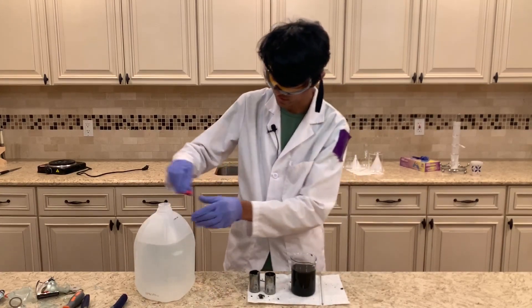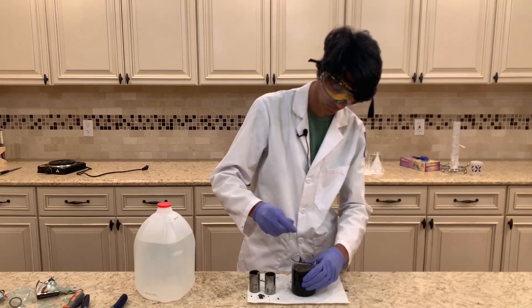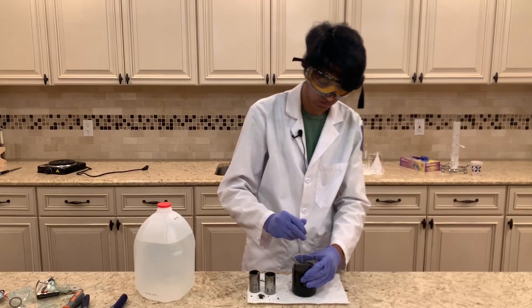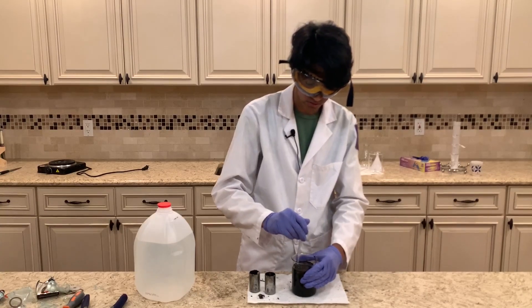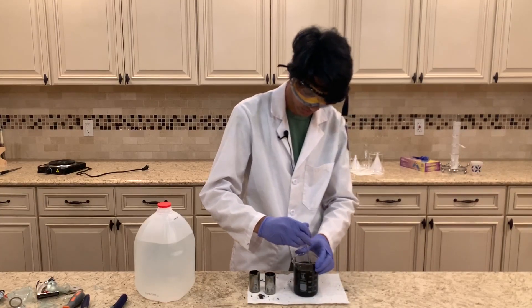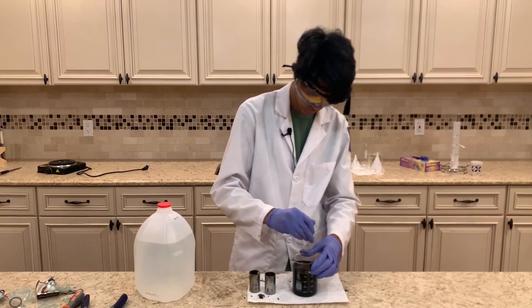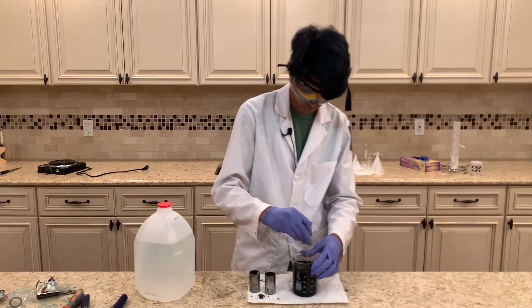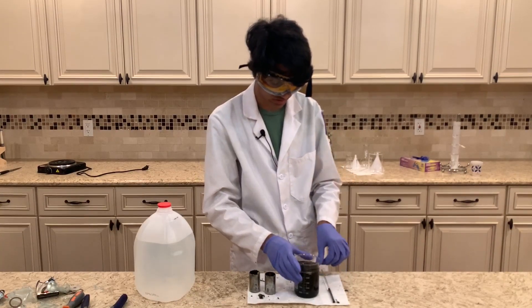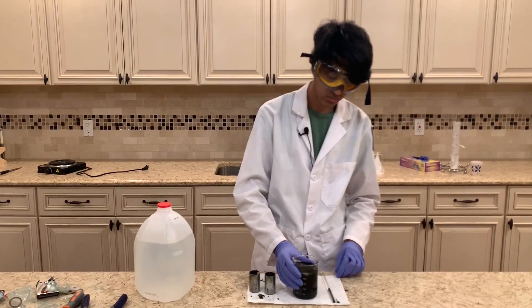I added the distilled water and now I'm mixing it using a glass stir rod. Basically what this is going to do is get rid of anything that's water soluble in the manganese dioxide, and that will include the electrolytes that will be in the solution. Now that I'm done mixing it, we'll have to let this sit, then let the manganese dioxide separate out again and run it through some filter paper.